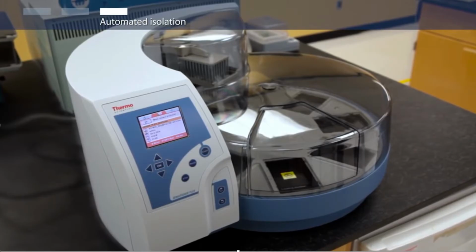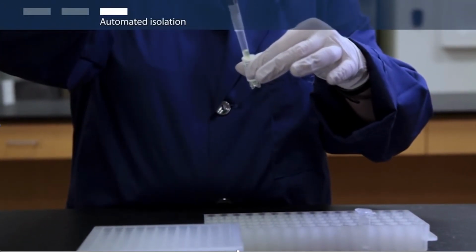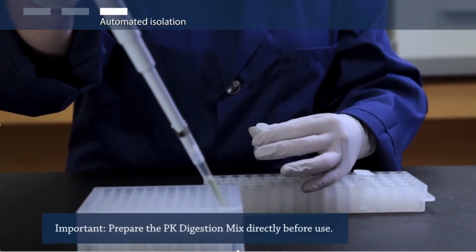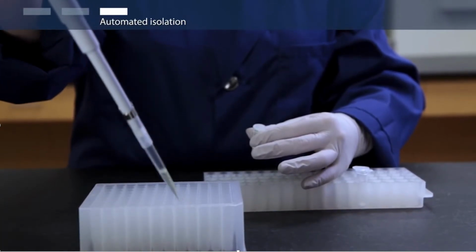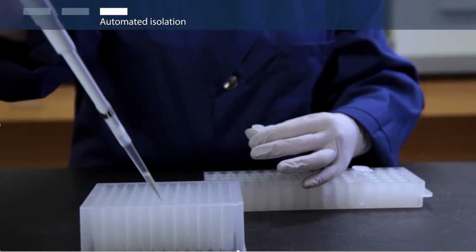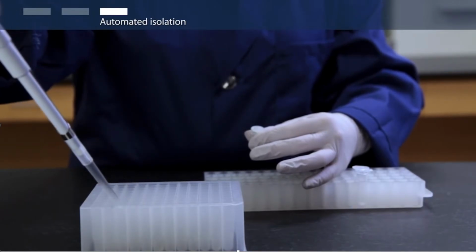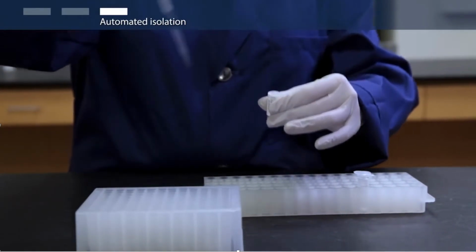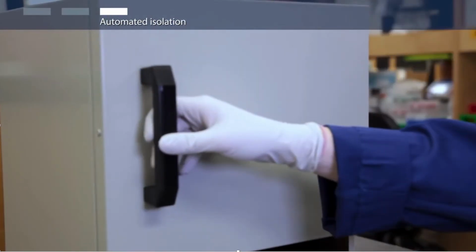Plasma samples. First, prepare your wash solutions and DNase mix as described for manual isolation. After thawing your samples, add 100 microliters per well to the MagMax Express 96 deep well plate. Next, prepare your PK digestion mix. Add it to the samples, cover the plate, and shake. Incubate the plate at 65 degrees Celsius for 30 minutes.